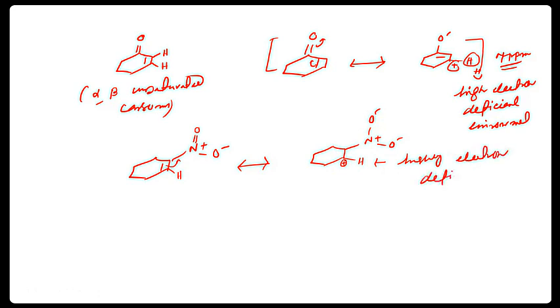Its value comes in the region of 7.3. And we know that the electron withdrawing efficiency of nitro is more because of the minus R effect, as well as the nitrogen itself withdrawing electrons by the minus I effect. But we are not going into that small change in value; rather we can understand that this phenomenon is happening, this type of delocalization is happening here. That's why, in spite of being an alkene, its signal arises in the aromatic region.